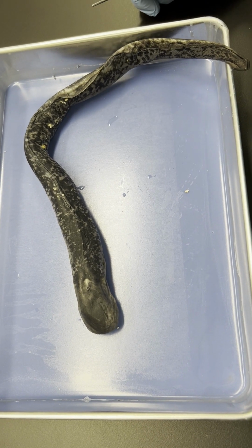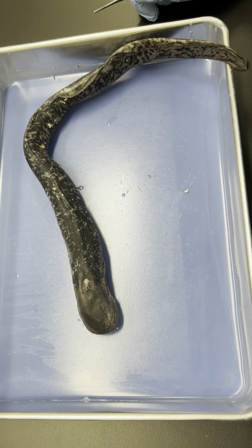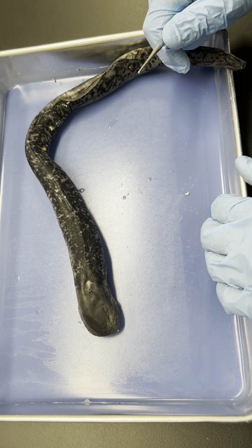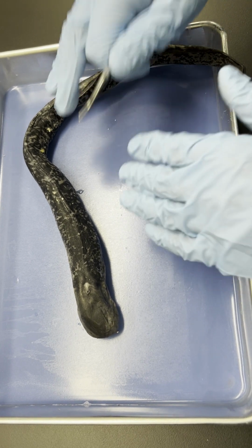Today we will be going over a lamprey. So lampreys are jawless fish. They are a very primitive fish in the taxon Agnatha. So what does that actually mean?